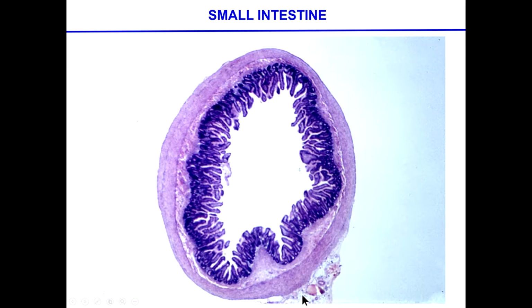But here, I want to make sure that no one gets confused. If you were to get this picture, which I have no idea whether you'll get it or not, it's not up to me, this is not a nerve ending. It is not in that position to stimulate anything for this cell. This is a portion of that membrane, the mesentery membrane that is part of the linings of the way the gut is organized inside the limited space that we have in the cavity.